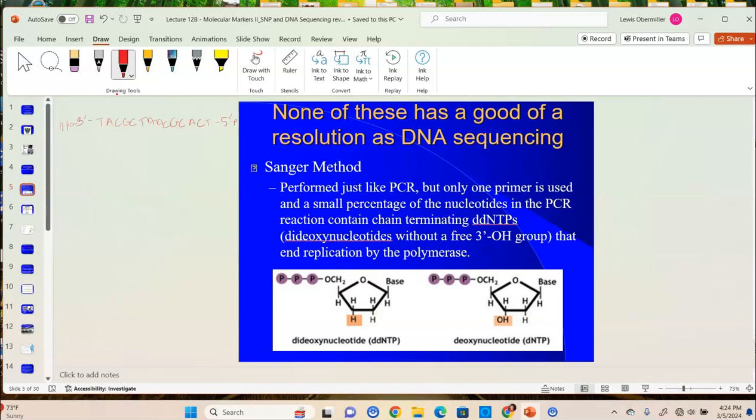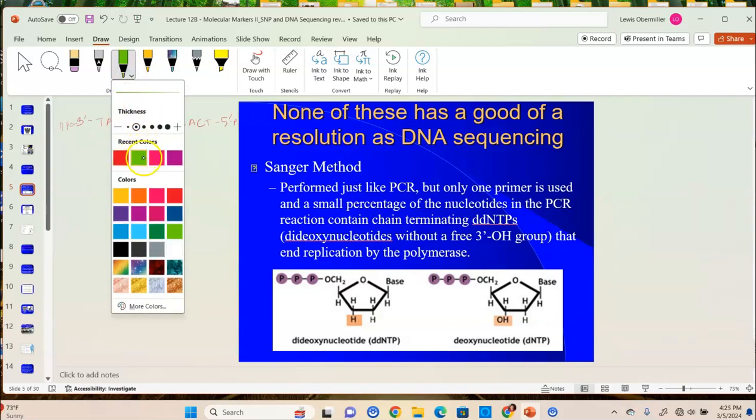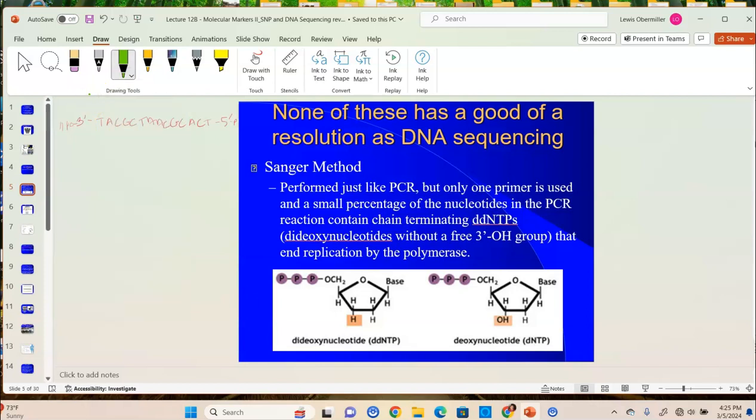And this works just like a PCR reaction. So we're going to need a primer. Normally, we use the same primer that we would for the PCR product because that's usually how we're doing the sequencing. But we would order this primer up. And let's say that if this is the T, we'd order an A. That's 3', we'd order 5', and this would be T, and this would be G, and this would be C and G, and so on. And then let's remind everyone there's a hydroxyl group, so we know that the synthesis by the polymerase is going to be from the 5' to 3' direction, so from left to right.